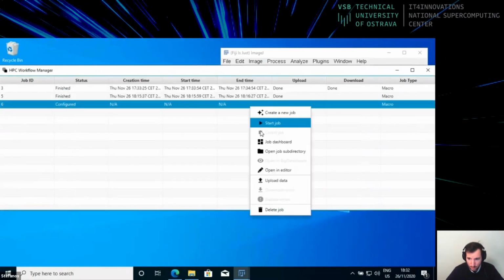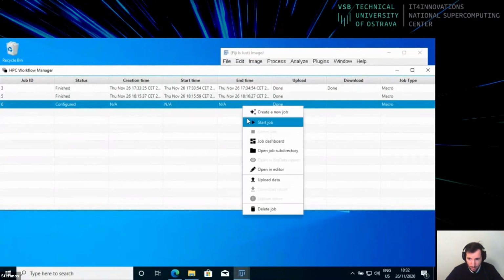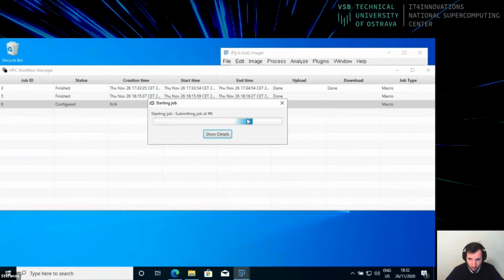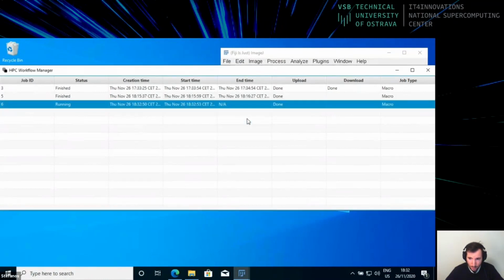You should use the last snippet. Remember to upload. Okay, once it has been uploaded, then start the job. And remember that when this job starts running, like it is in this demo, it will take 30 minutes. So we're going to see how the progress bars look now. Going to open this.